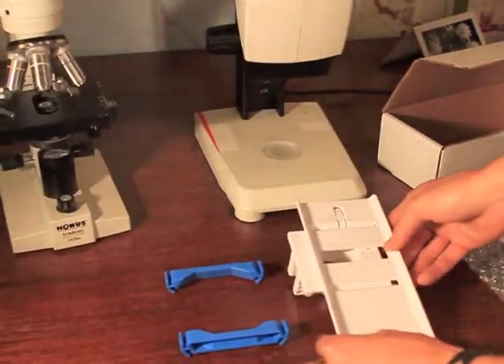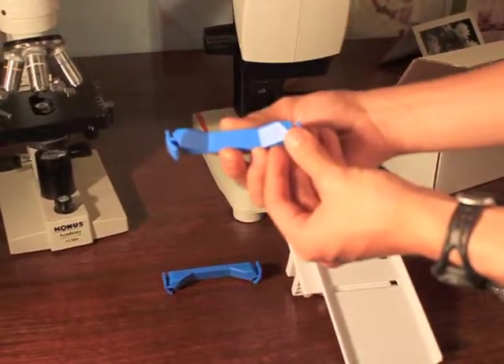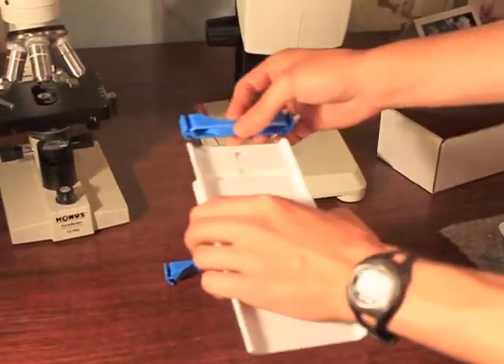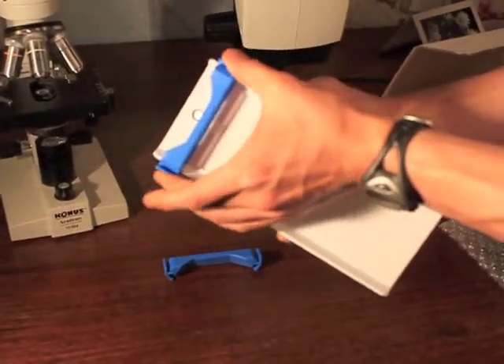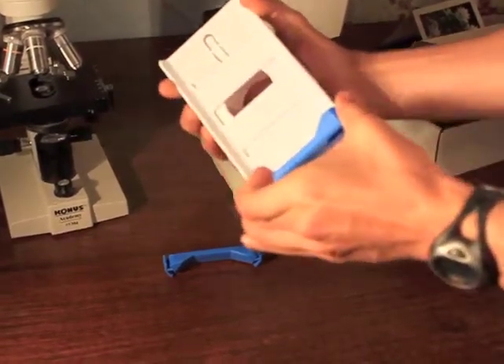The third component is the clip. The Skylight comes with two of these, and they are going to cradle the cell phone on the stage. The clips slide on the stage like this. You squeeze these wings of the clip, and the clips will loosen and slide.